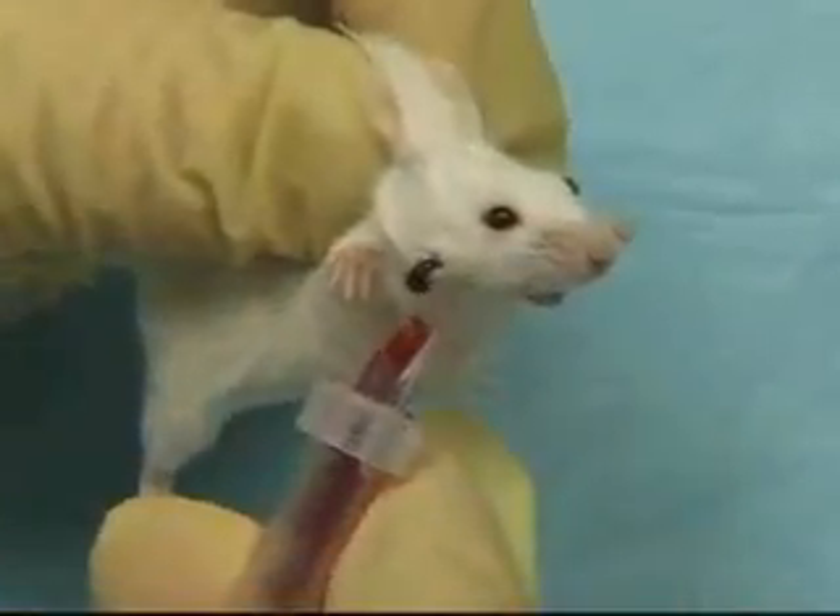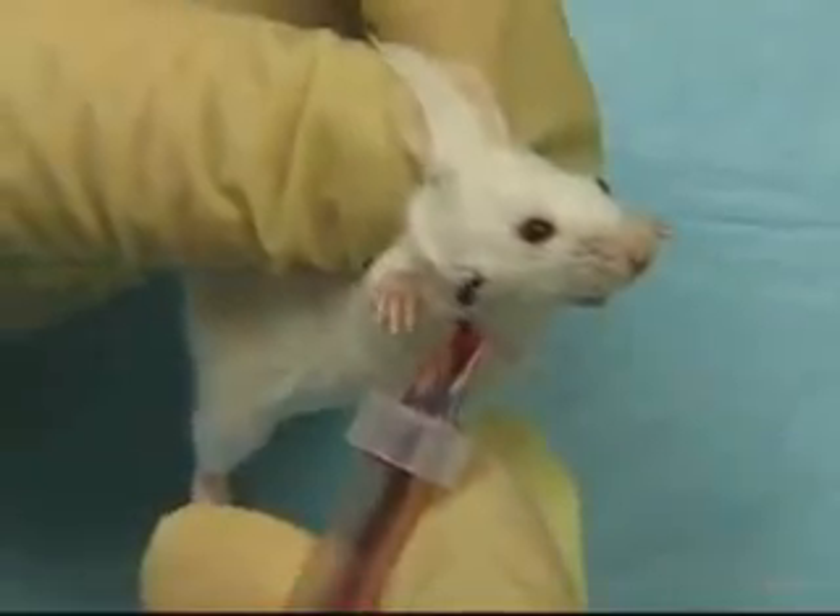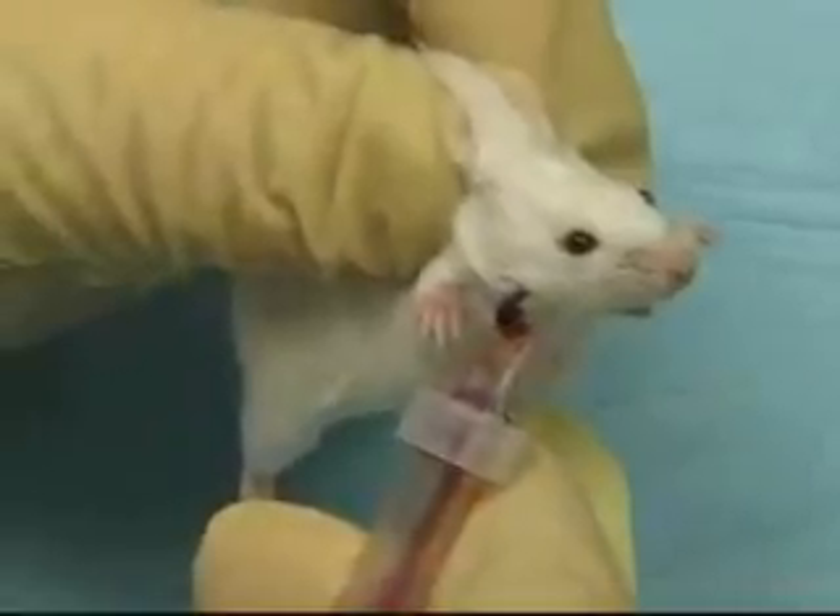Using inexpensive Goldenrod Lancets, one or two drops to a half mil of blood can be quickly and easily drawn without hurting or losing the animal.